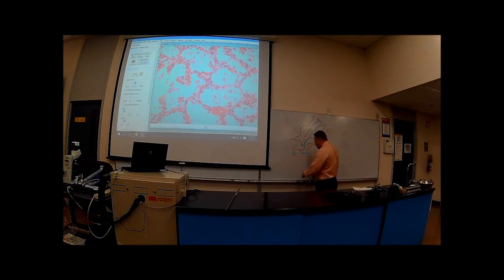Cells are going to be going into the lumen. Fluid is going to go into there. The cells that we're talking about are inflammatory cells. You're going to have a lot of fluid, as we've seen, with any kind of inflammation. There's going to be swelling there, the cardinal signs of inflammation. So now look what's going to happen: this is going to fill up with fluid in here because of the inflammatory process.